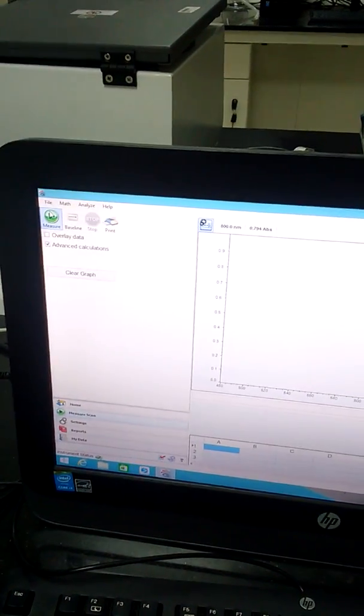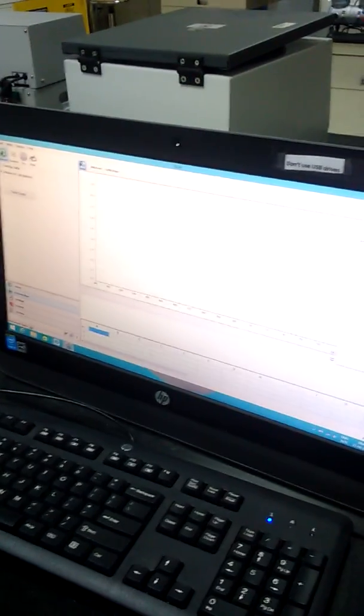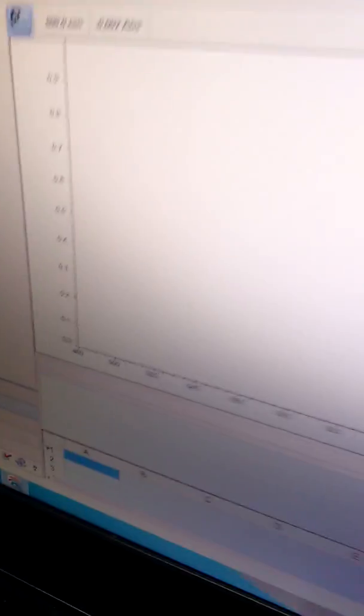Before taking UV, record baseline. Record the UV-Vis spectrum from 480 nm to 800 nm.